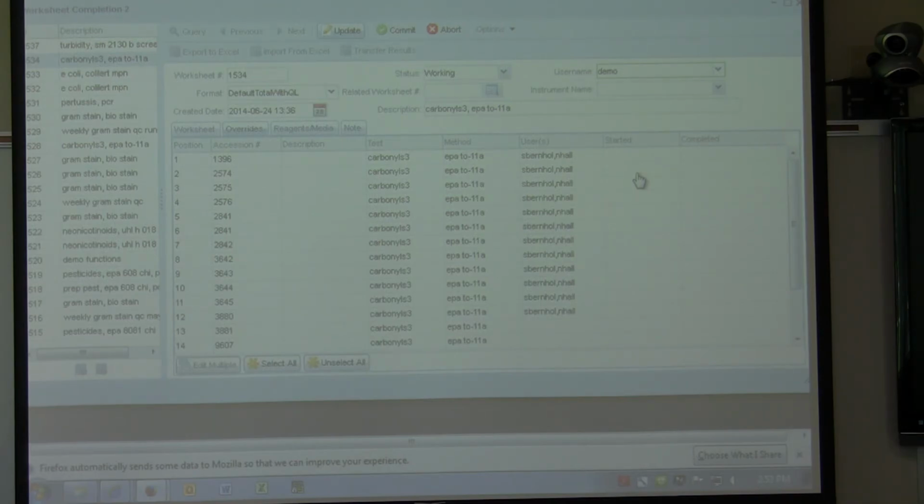I think I had it right. That you wanted to carry the extraction date from when they extracted it, because that becomes your QC on this analytical run, which is not what it's doing now. It's going to show your worksheet run date and time for that, rather than your extraction date and time. Okay, I think you're saying the same thing, which is different. Yeah. It could be the same idea. Well, we probably need to flesh that out offline. Yeah.